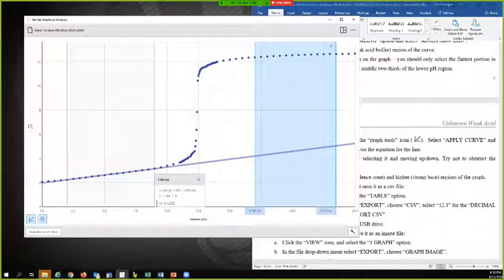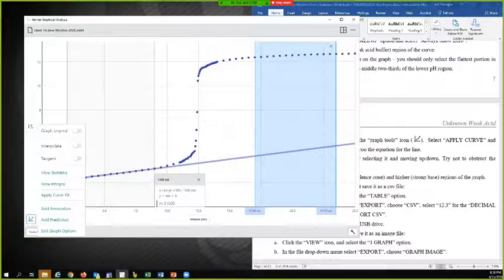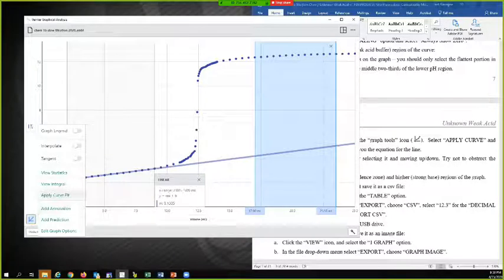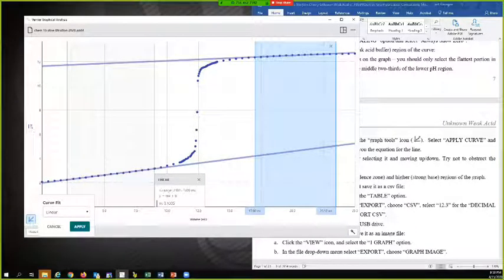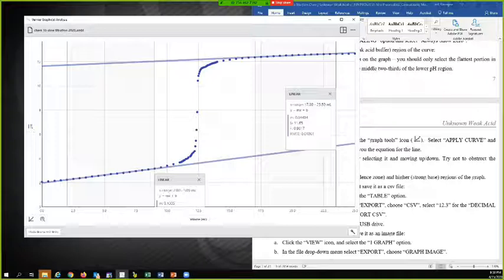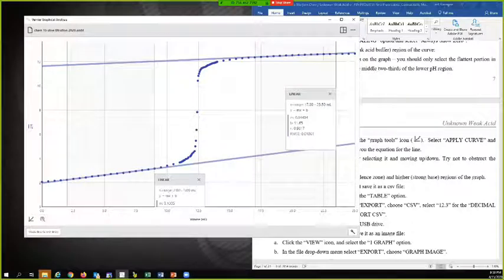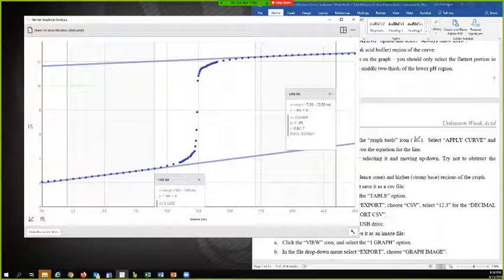And then I'm going to go back down to the corner here. And apply curve fit. It says linear, apply. And there it's going to give me the information about that line.